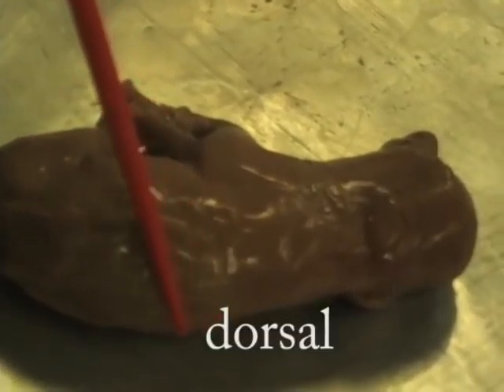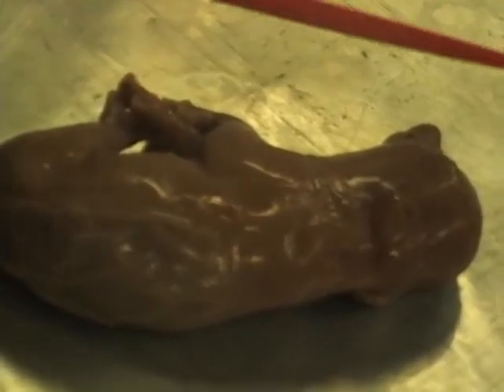So this is the dorsal, this is the ventral, the lateral surface is on its side, and here's anterior and posterior.